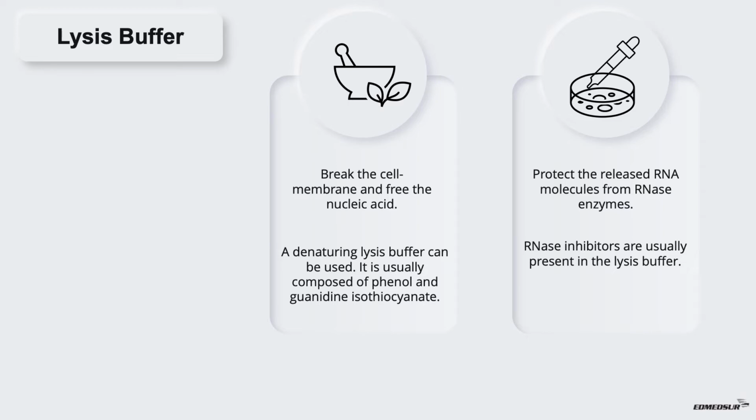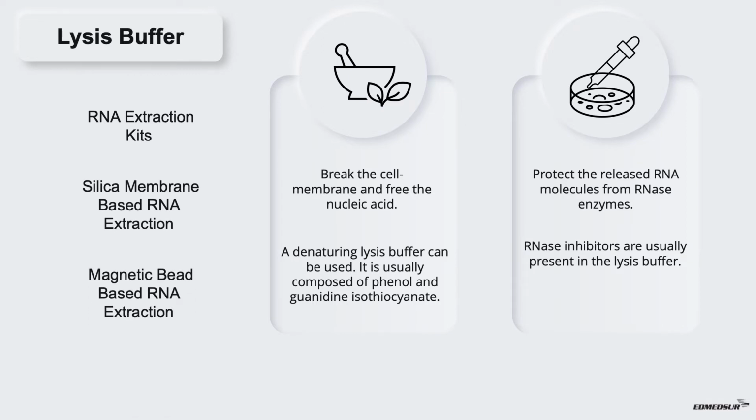There are several ways by which RNA can be extracted from the specimen, and there are many different RNA extraction kits available in the market. Here we will briefly discuss 2 solid phase extraction techniques: Silica membrane-based RNA extraction and magnetic bead-based RNA extraction.